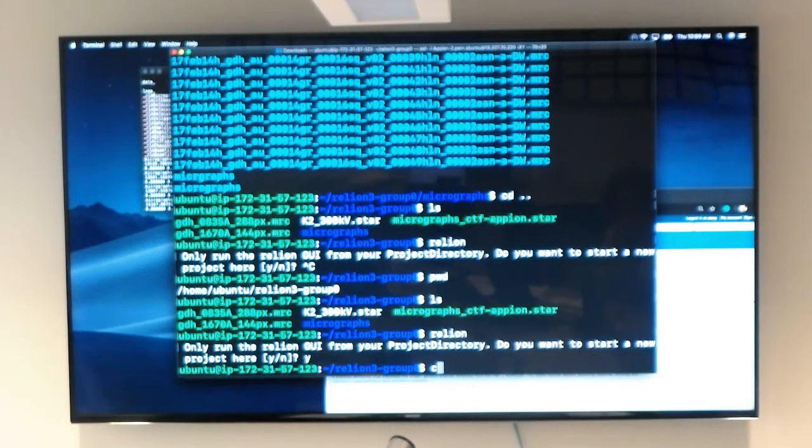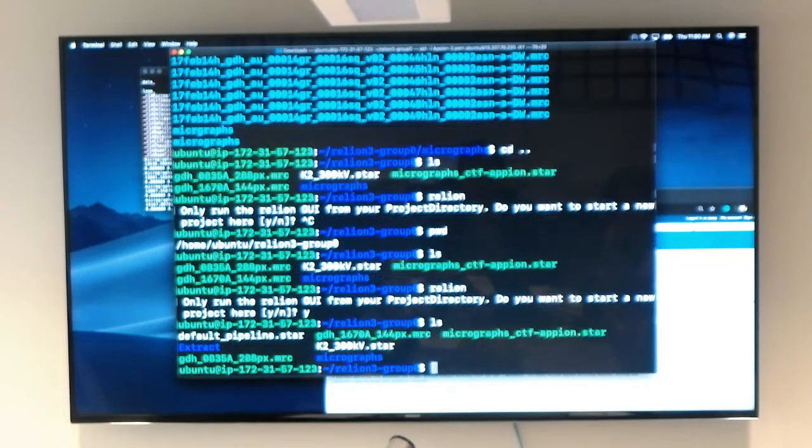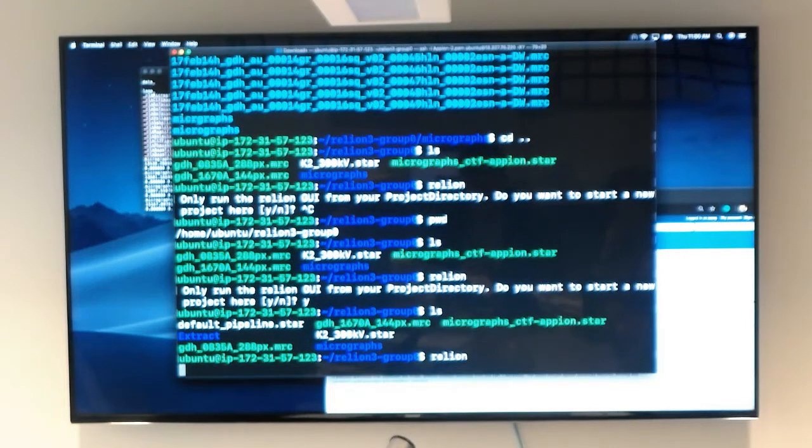And if you feel that you're a little bit more advanced, then you can try other things. So you can try other features that I did not cover within the tutorial. But the reason why I'm going to ask you to skip is that I also here have an initial model, such that if you want to hop into 3D classification, there's this file right here that you can use as your initial model.